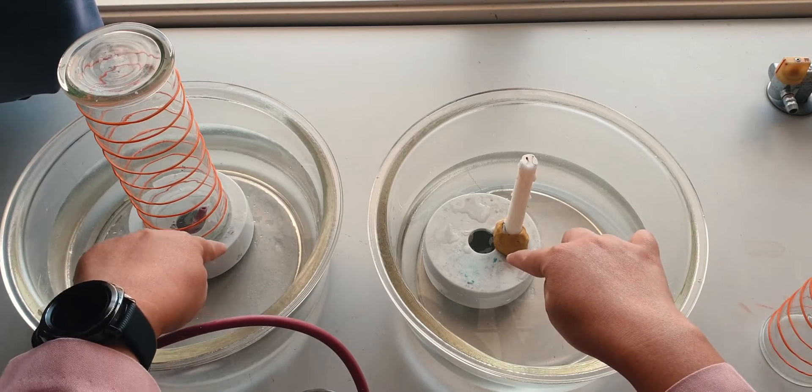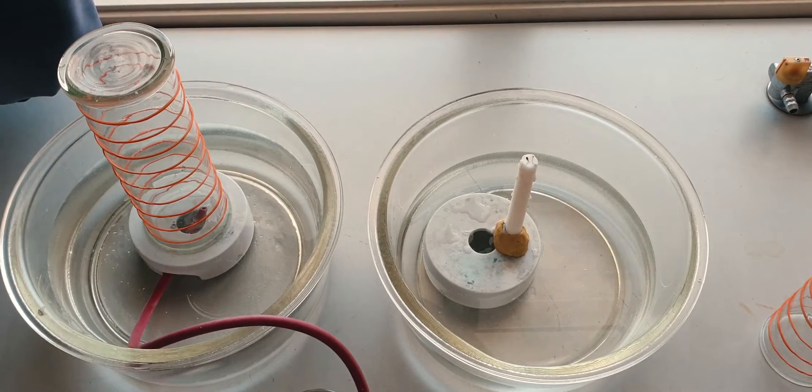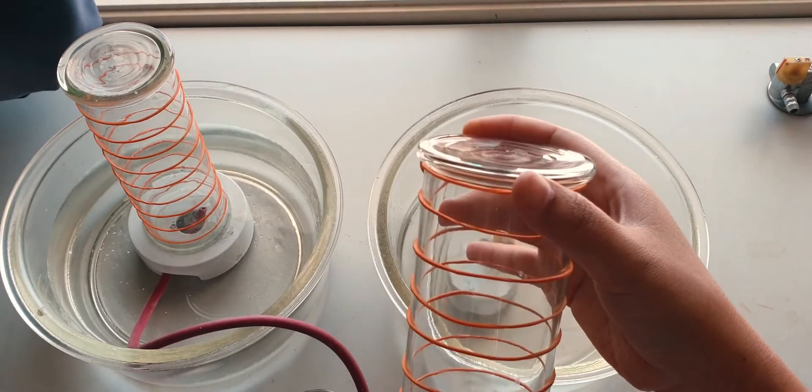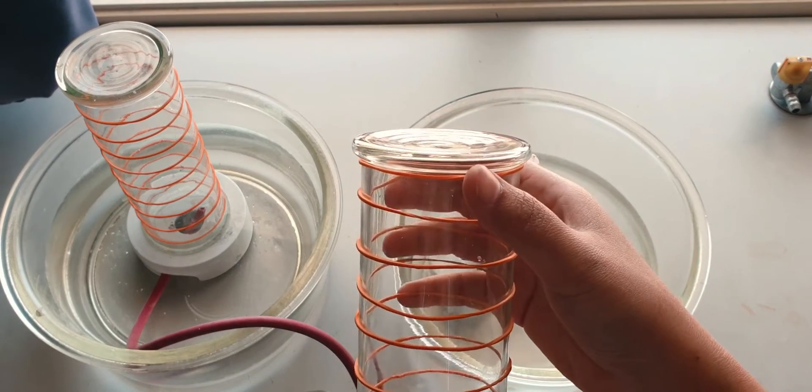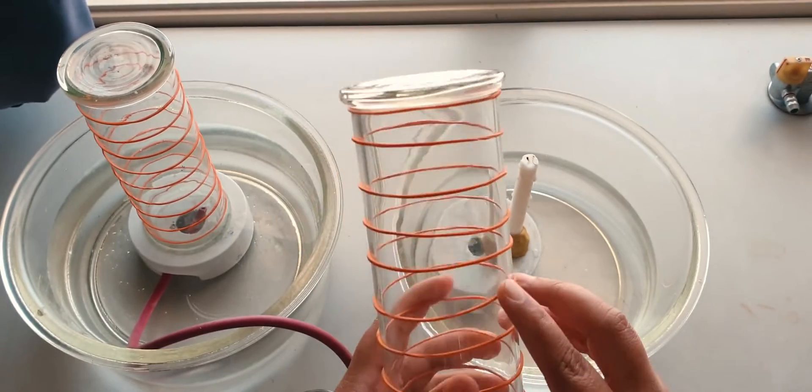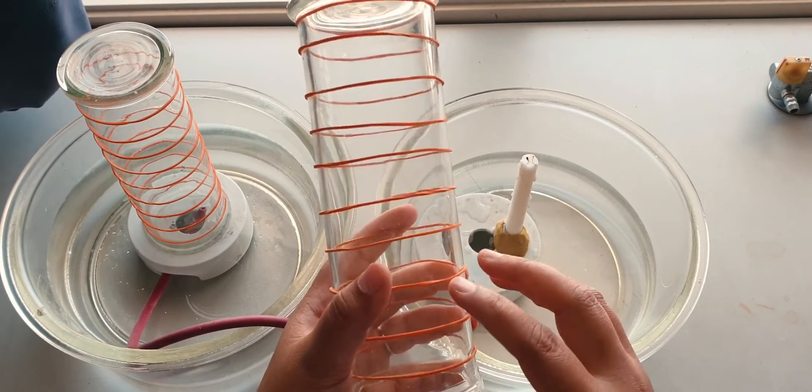And some tubes, rubber tube, and the candle stand over there. I have two candle stands there. What you need to do first is to divide the gas jar into 10 equal parts. I use rubber bands to divide the gas jar into 10 equal parts: one, two, three, four, five, six, seven, eight, nine, ten.